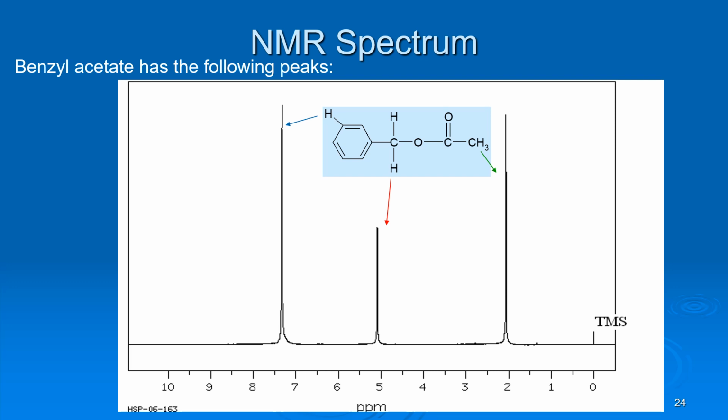All right, so if we look at this spectrum, and remember what I said earlier, we have to look at every peak in an NMR spectrum. We don't ignore any the way we did in mass spec or IR. So if we want to get an idea about which peak is which, at this point we're all relative, but remember I said that benzene ring hydrogens tend to be around 7 or 8. So these happen to be the hydrogens. There's 1, 2, 3, 4, 5 hydrogens attached to the benzene ring, and those are represented by this peak.